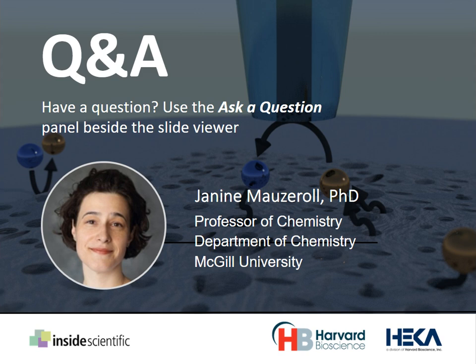And it also measures the difference. It sometimes has two wires. And SVET is also very useful in corrosion. So I would say it's like a complementary technique. Like most SECM instruments could be adapted to do SVET as well. It wouldn't be that difficult.